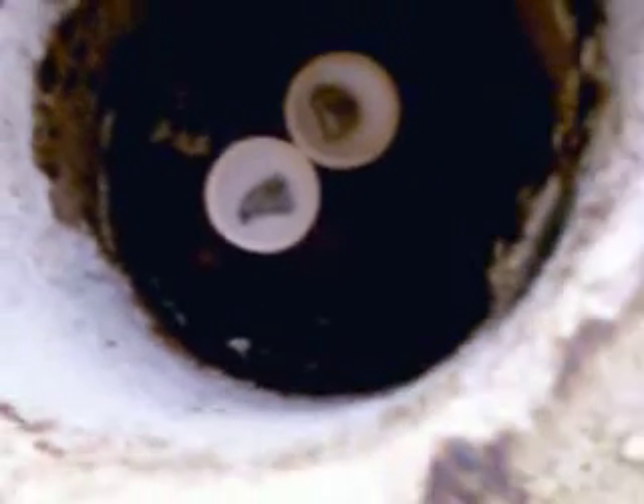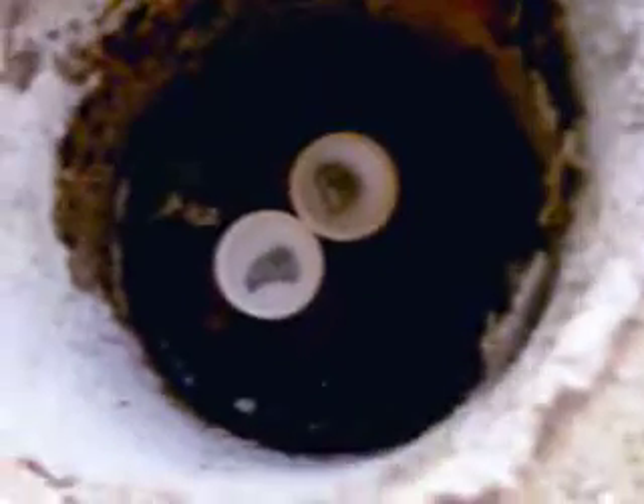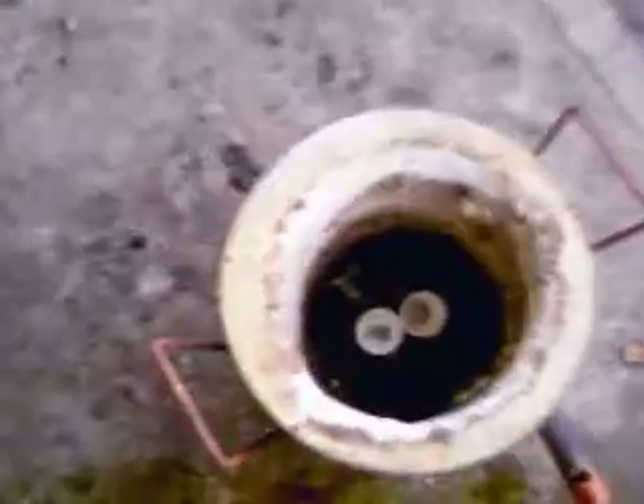Hello, this is Rick. I'm back. I've got both the cupels with two exact mounts loaded in the furnace. I'm getting ready to light it and let it go and see where we go from there.